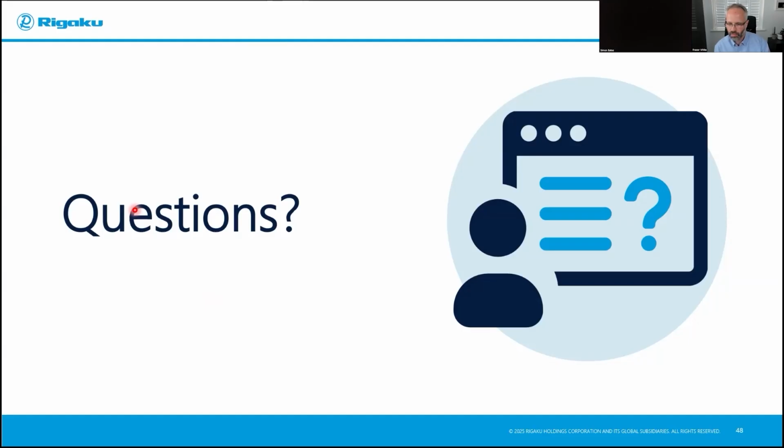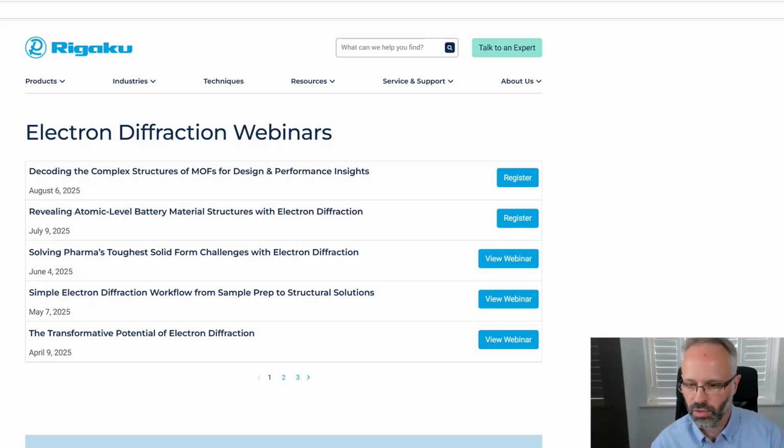Yes, that is the whole point of the analysis that we've been doing on lipid nanoparticles. That is possible. Of course, the diffraction pattern is made more complex because you see the lipid on the outside, the shell, so you get diffraction from that as well. So it's a more complex arrangement. But if the shell is more amorphous, more disordered, then the diffraction peaks stand out quite clearly. And then, oh dear.